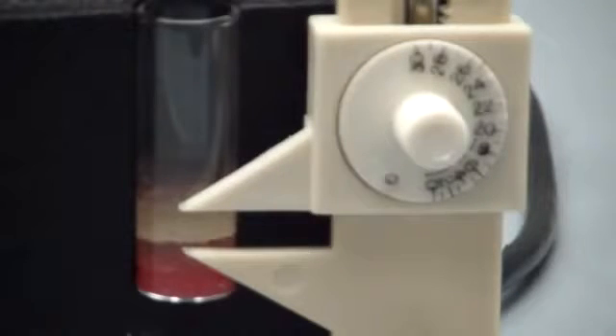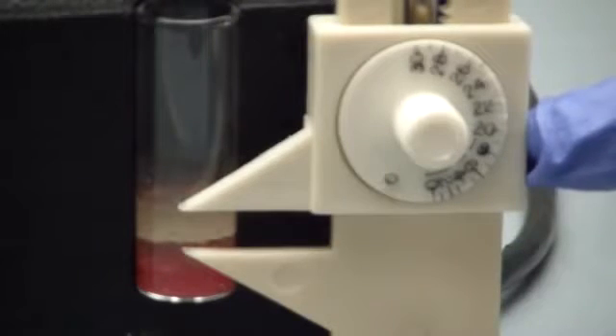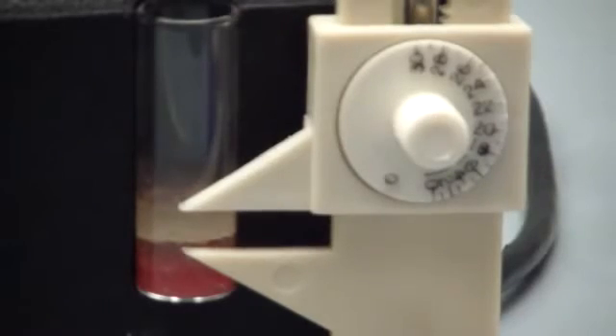To ensure accuracy, make sure you are at eye level when setting the upper and lower jaw. Once they are both set, you can read your number right here. Whatever number you get, subtract that from 100 and that will give you your percentage of lean meat.